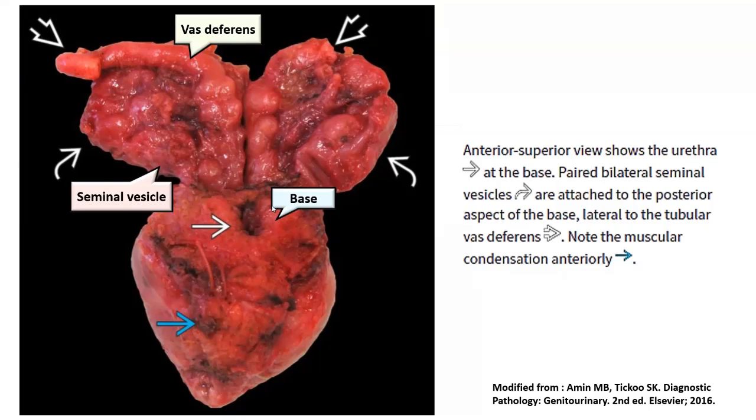The first being the base of the prostate, on which the base of the bladder basically rests. And you have the opening of the prostatic urethra, which runs all the way through the prostatic parenchyma, and ultimately opens into the apex. Now, this base and the apex are two important margins which will have to be sampled in their entirety when it comes to grossing the radical prostatectomy specimens.